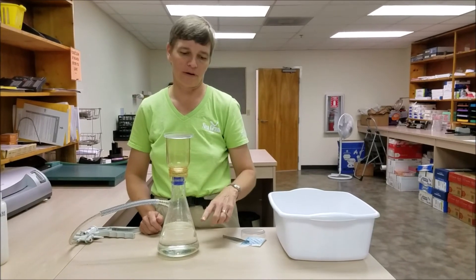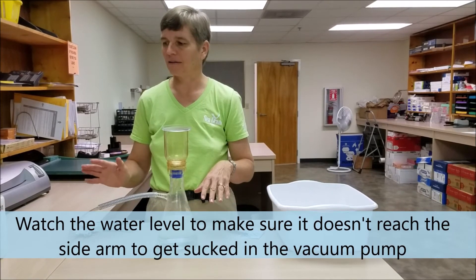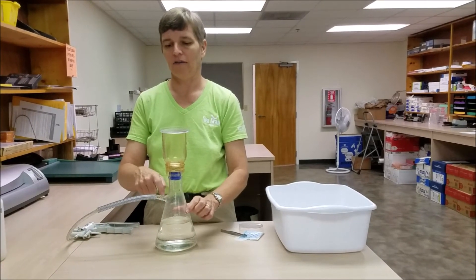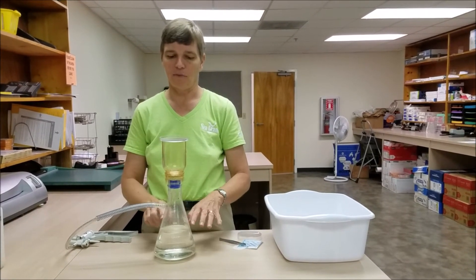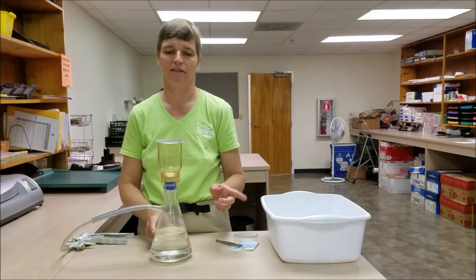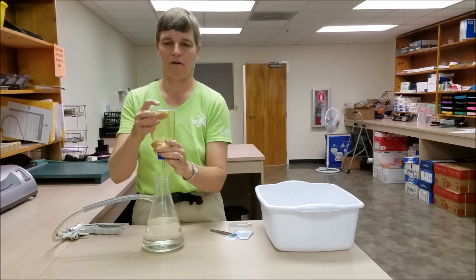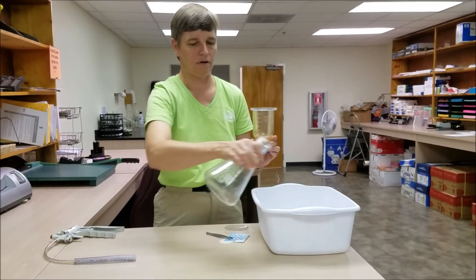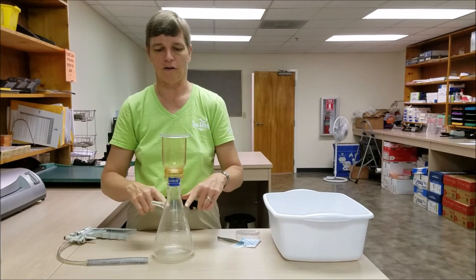As you're filtering your sample, it's important to keep an eye on the water level in your Erlenmeyer flask. If your sample bottle was really full, there is a possibility that you could have enough volume to actually suck water through the sidearm and into your vacuum pump — you don't want that to happen. So before you add your final amount of sample, go ahead and loosen the filter holder, discard the water in the flask, and then put the filter holder back on before doing your final third of the sample.